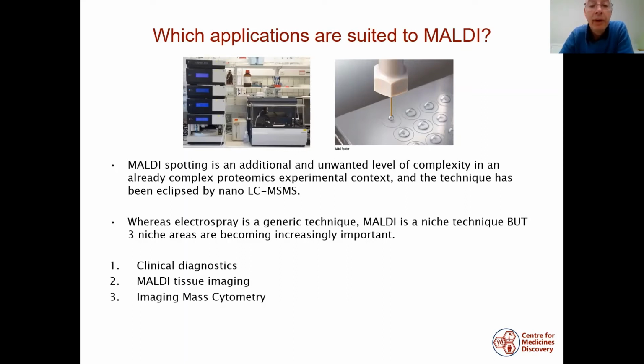Whereas electrospray I would describe as a generic technique, I wouldn't describe MALDI as a generic technique anymore. I would describe it as a niche technique. However, there are three areas in which MALDI is becoming increasingly important. As I mentioned, these areas are clinical diagnostics, MALDI tissue imaging, and imaging mass cytometry.